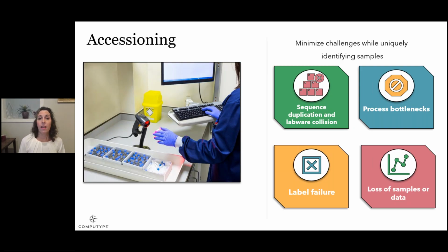So for example, a lab could be using barcoding and printing on a paper label for a tube that has to be put in the fridge. So they are using unique identifiers. But the other problem, though, is that they take on the risk of duplication because they're using spreadsheets to help keep track of the next number to use.